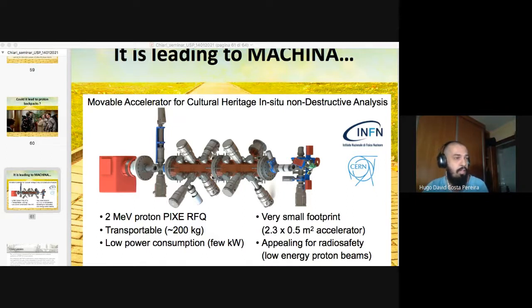They use X-ray fluorescence. And I would like to know from you if you have any thoughts on how we compare this technique with PIXE and RBS. How can we separate them? Which one is better? If they have any major differences?